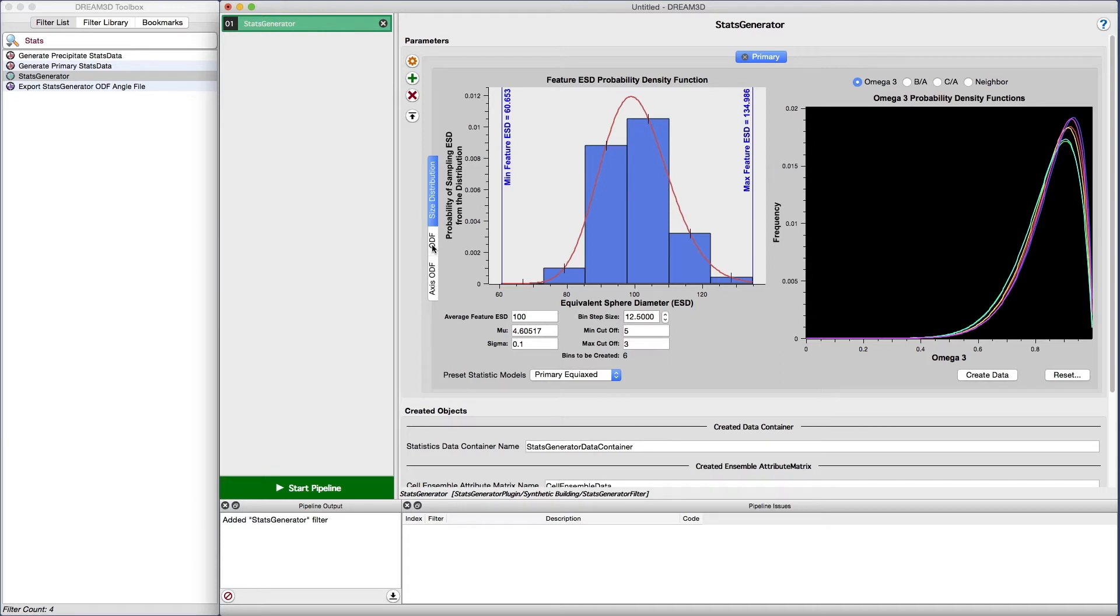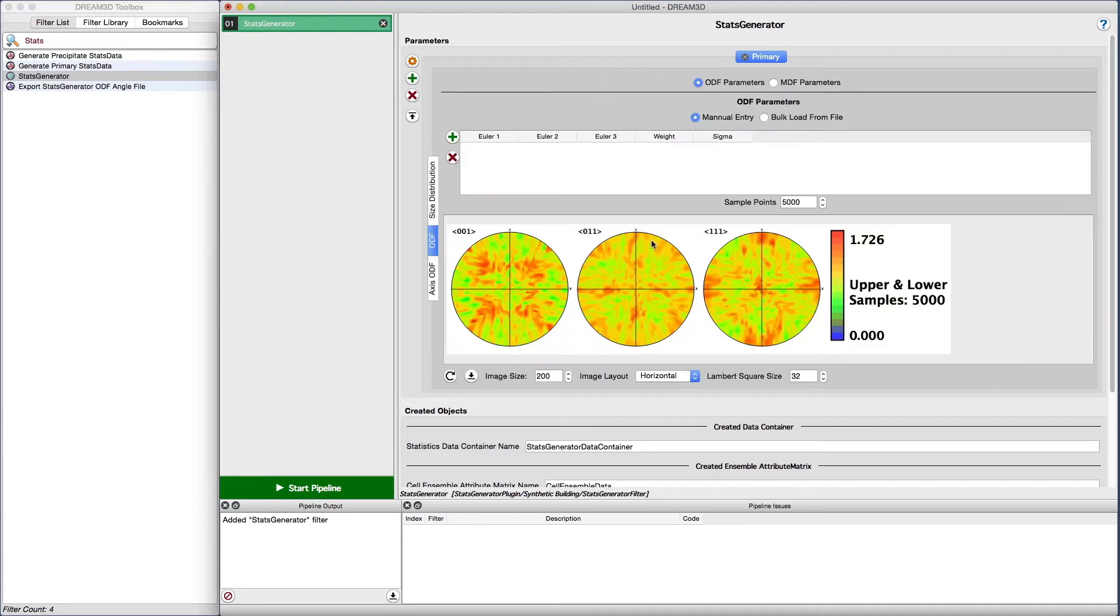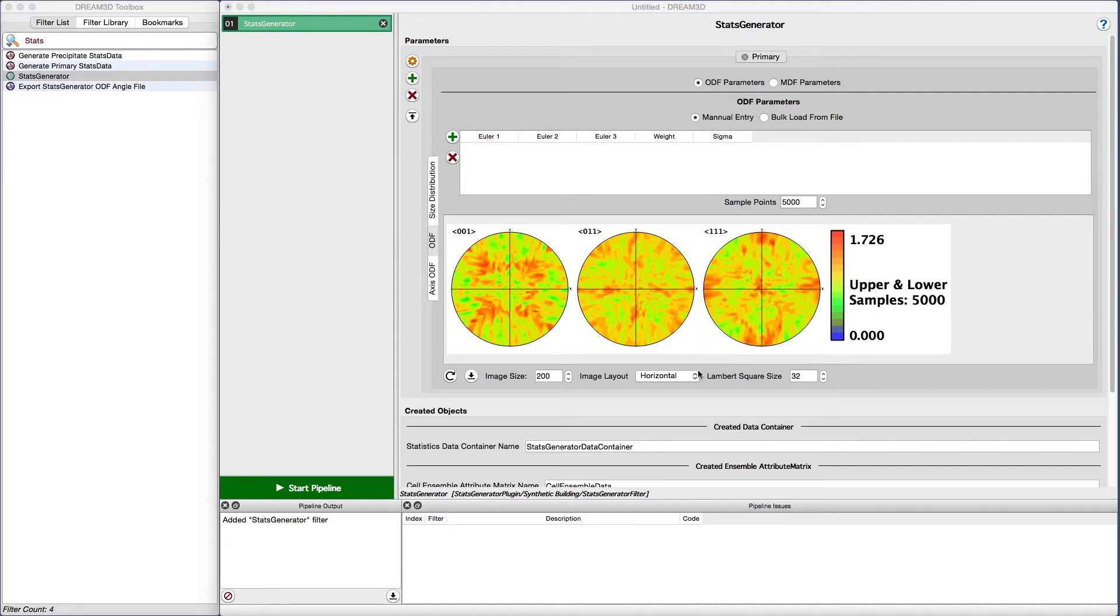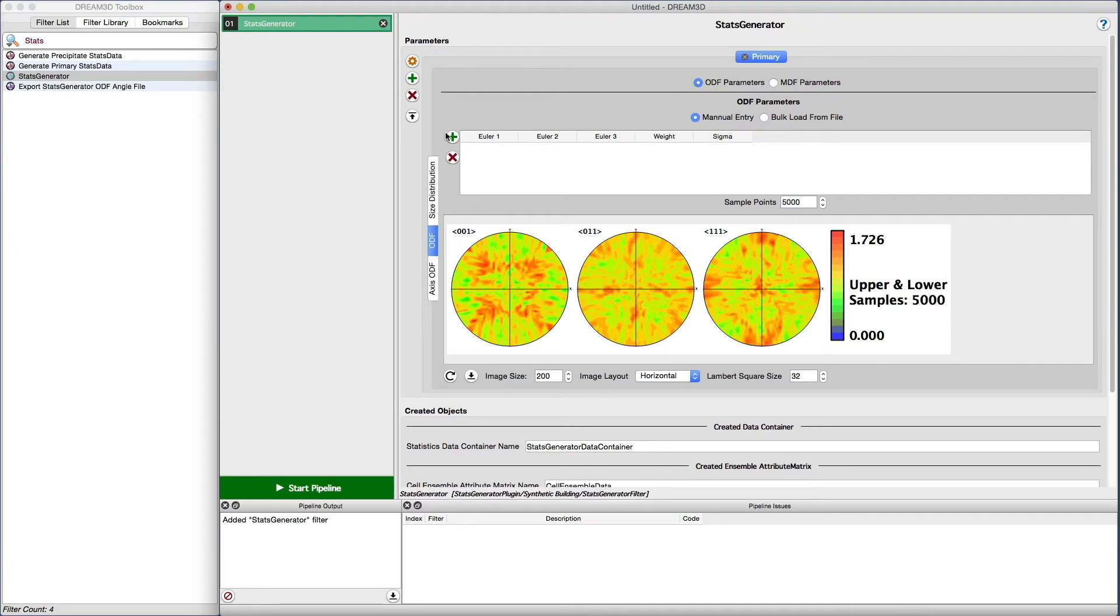Moving on to the crystallographic statistics, the first area is the ODF tab. Clicking on this tab will show you an area to enter specific texture values in the resulting pole figure. The initial pole figure shows a random distribution of orientations as evidenced by the scale only having a max value of around 1.8 to 2.